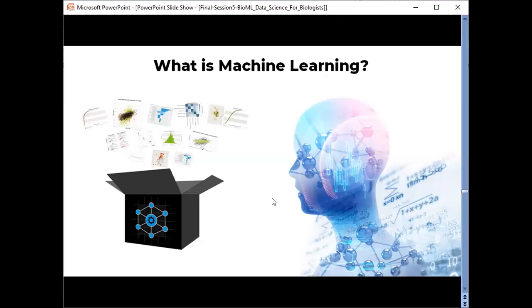But here we are interested in how machine learning can help us study big RNA-seq datasets. So we will limit the technical details of each algorithm, and instead create a logical series of steps that will illustrate how the methods are useful, as well as what they might offer to study biology in RNA-seq data.